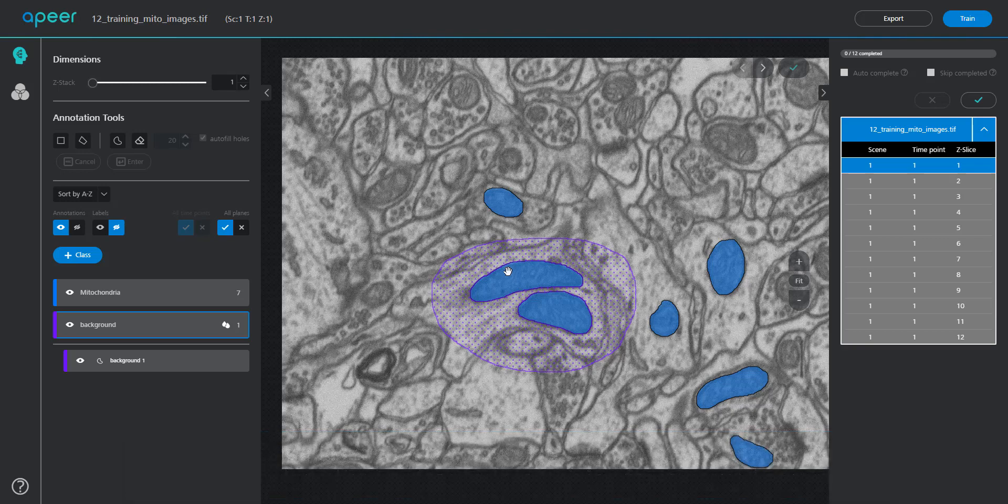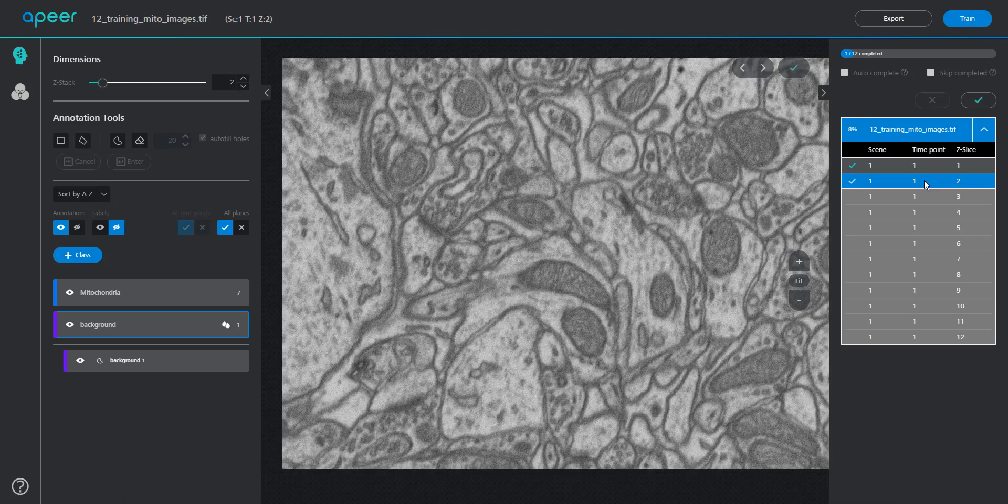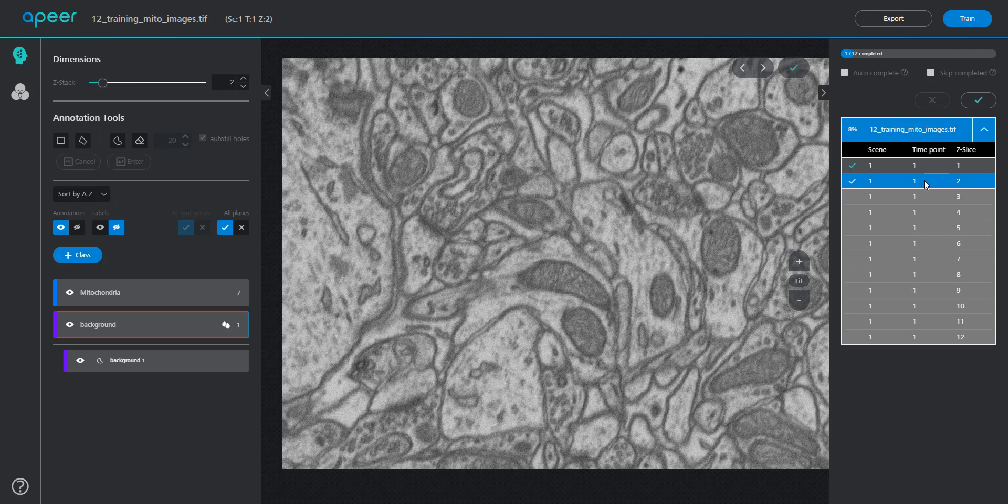Once you're done with annotating an image, please hit the complete button. Continue your annotation by annotating other images.